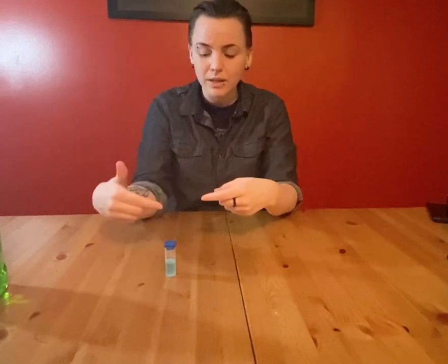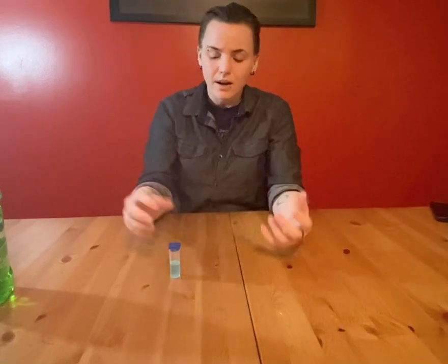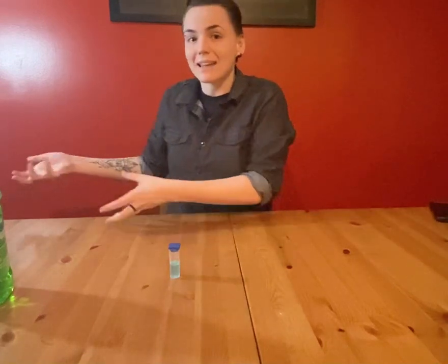So by adding the dish detergent, you're actually dissolving the membrane of your cells and the nucleus, because DNA is held in the nucleus of your cells, which is basically the brain of your cells. That's where all of your genetic information is stored. That makes you, or makes fungus, or makes cats. It's all the same. It's basically what makes you your own unique human being.